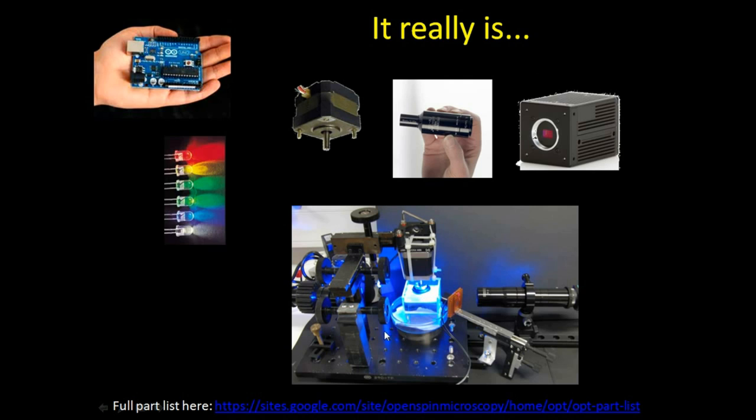You have this apparatus here, which is basically a holder, and this holder has the ability to move the whole motor and axis closer to the lens. For this kind of microscopy, and this was something that was confusing for the Nikon jury, very often with optical tomography, you have to demagnify because samples are commonly larger than the size of the chip on the camera.